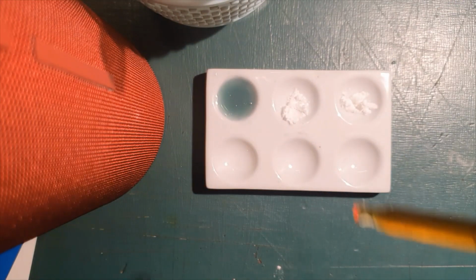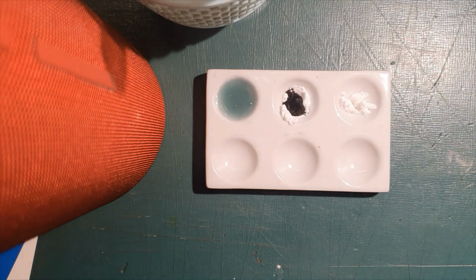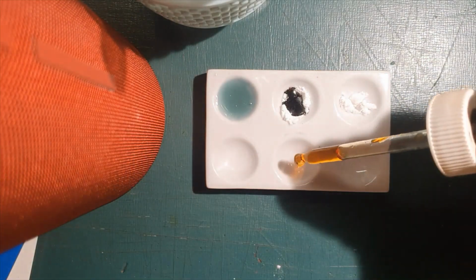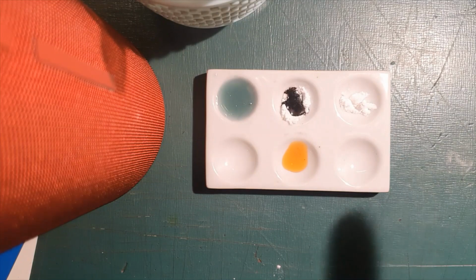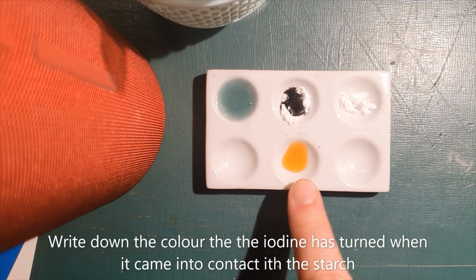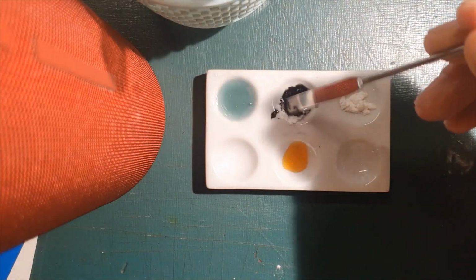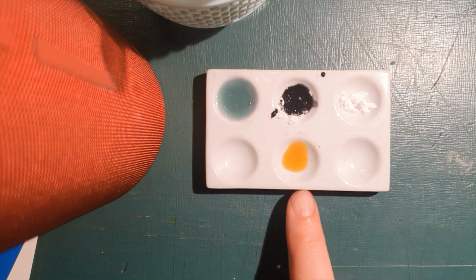What's going to happen with the iodine? Oh, whoa. Okay. So I'm just going to show you what iodine looks like by itself. There you go. So that's what iodine looks like. And this is what has happened when we mix it with starch. Is there a reaction there? Write down your observations. Okay, so that's iodine.